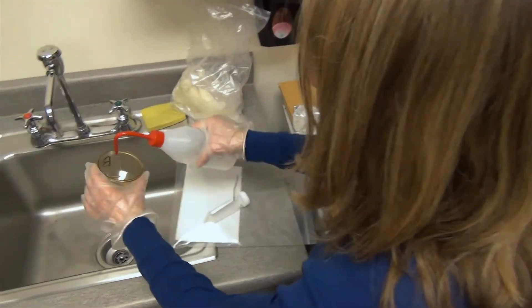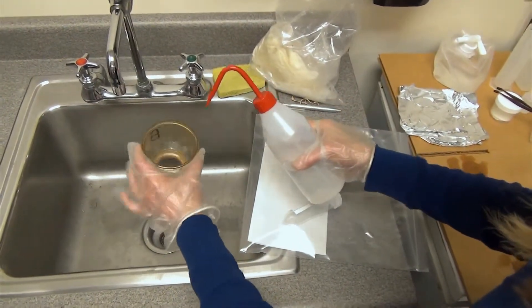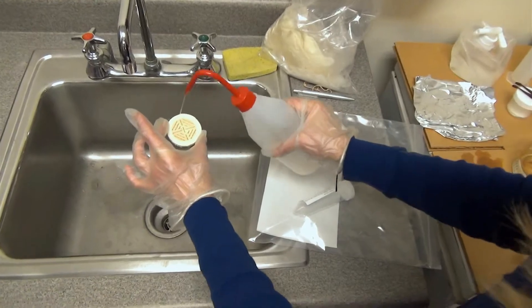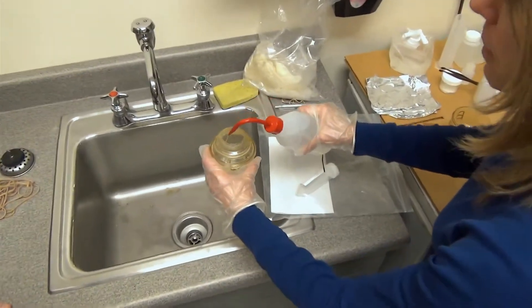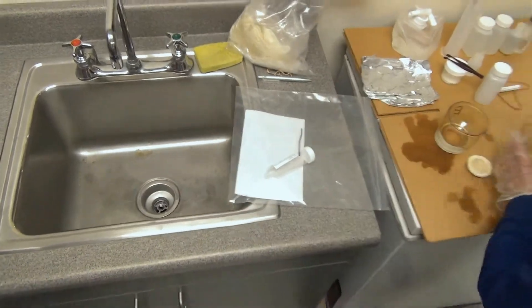We're right next to a sink, so just rinse them — once is fine. You'll do the same with the other two pieces. It's not necessary to fill them with distilled water, just enough to rinse them out to make sure any debris that accumulated from the last processing is completely removed.